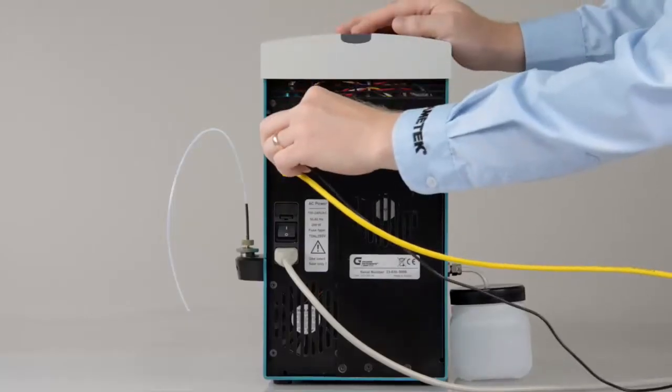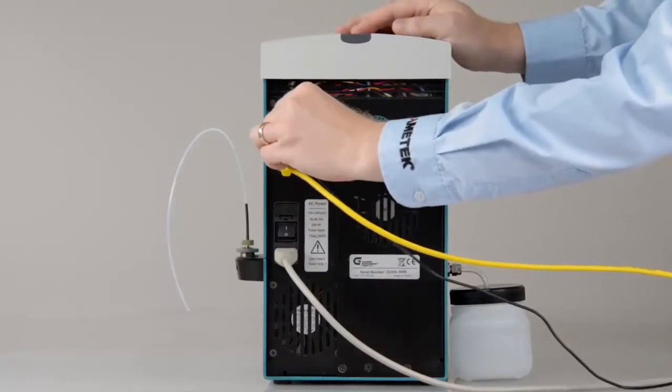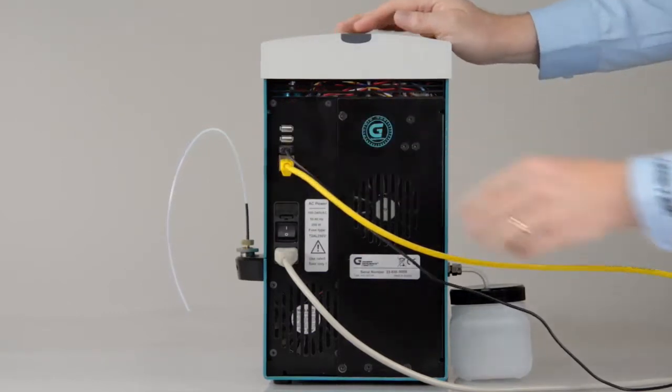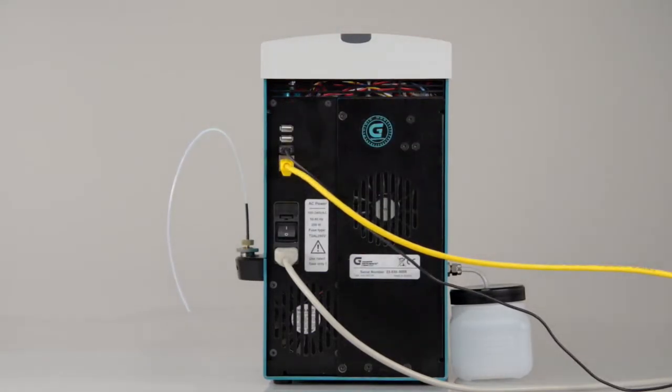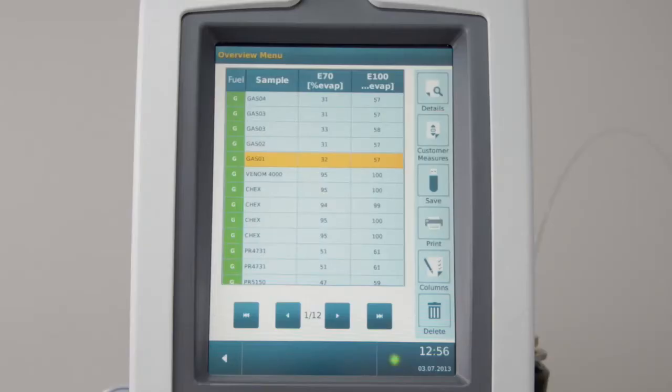To print results, attach a PostScript printer to a USB port. To print all results, click Print in the results list.